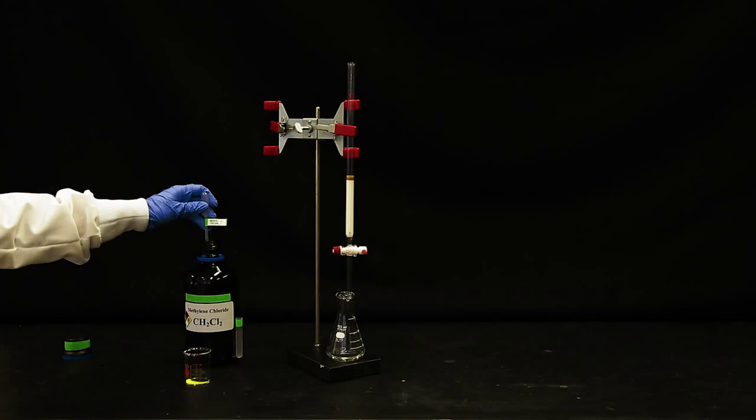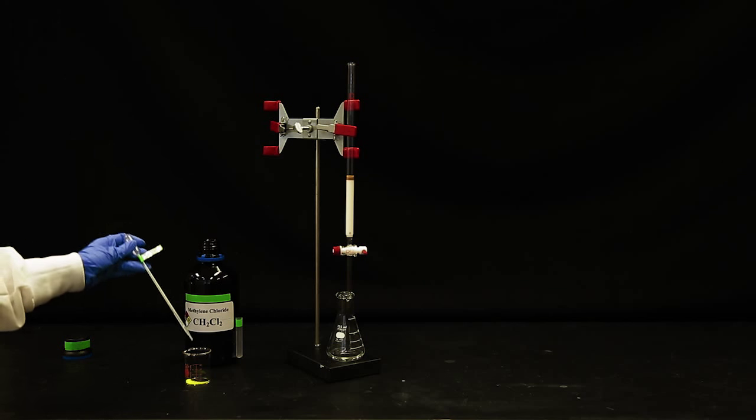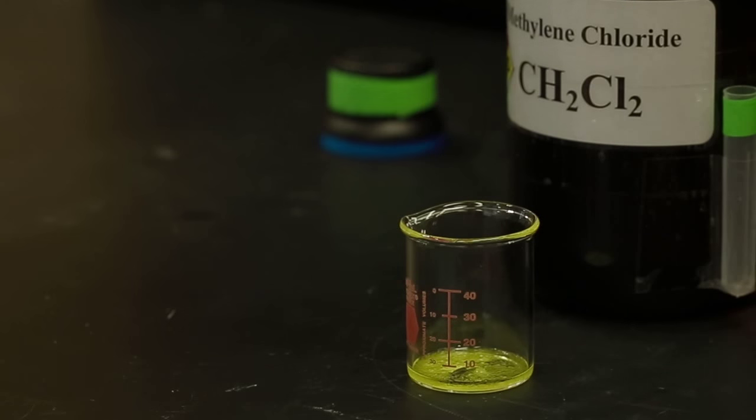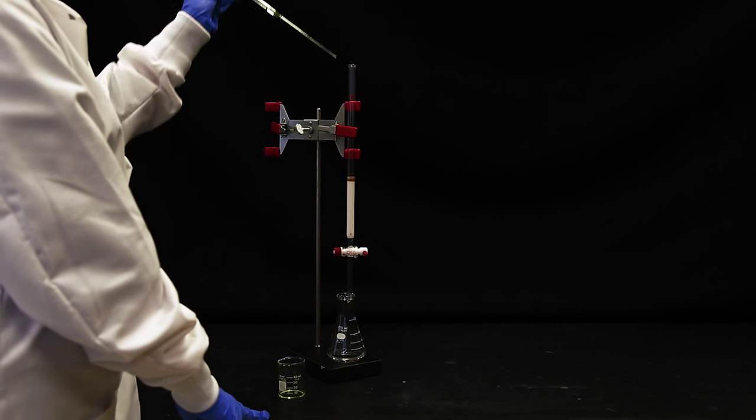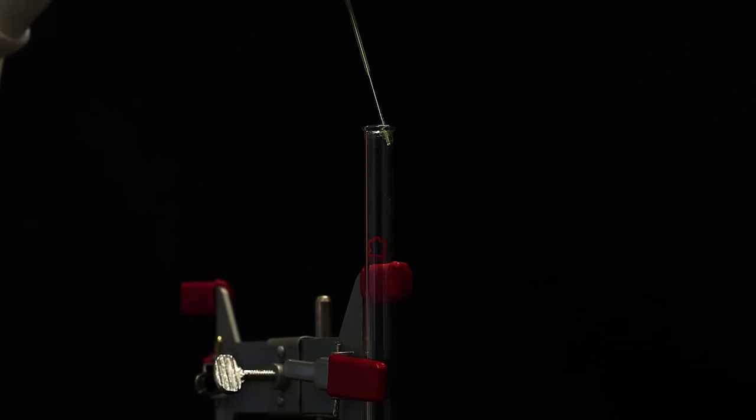Dissolve the crude product in a small amount of dichloromethane. Add this to the top of the column by carefully pipetting the solution around the edges of the column, allowing it to run down the sides.